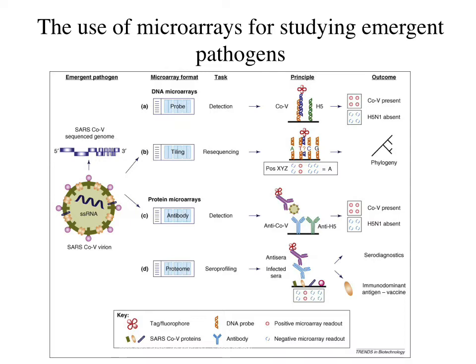As illustrated in B, 4 probes, one for each nucleotide base, are used to determine the genotype at a given loci. A set of probes designed for an arbitrary position XYZ is shown to reveal the unknown base to be adenine. Multiple probe sets are tiled across the whole pathogen genome and, upon hybridization and analysis, can confer the complete sequence information of the pathogen with great accuracy.